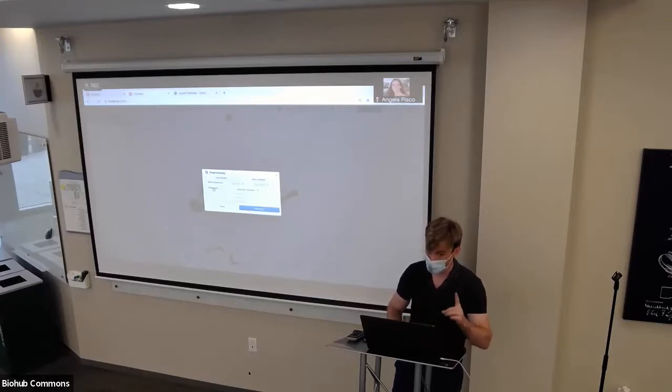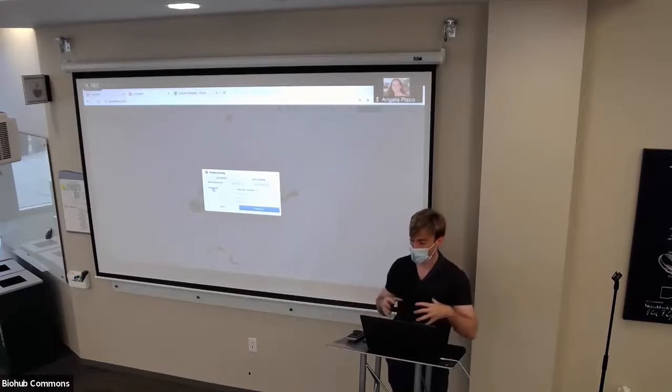But let's say you had 3 batches of data, right? And each batch you want to analyze or pre-process in a different way. Maybe one of your batches was already log transformed and filtered. So this is where this batch pre-process checkbox comes in handy. So you would click this batch pre-process, then you would choose your batch key. This is just the name of the categorical variable that stores this information. So we have org ident.